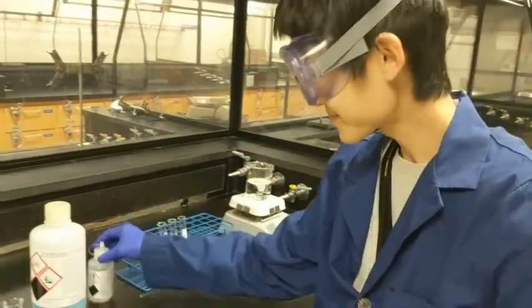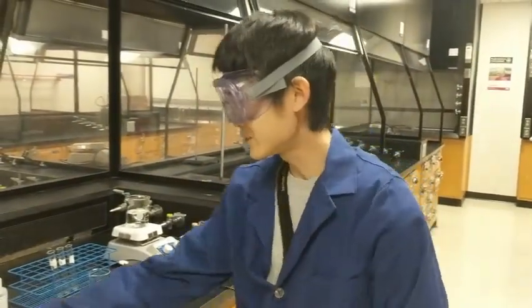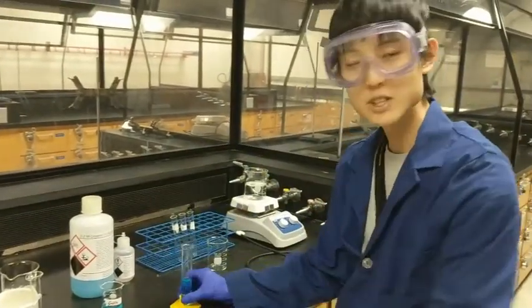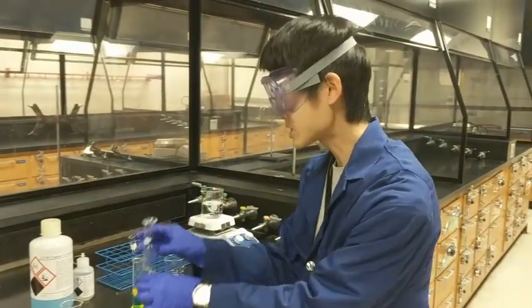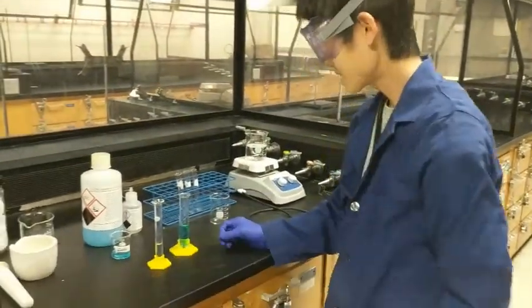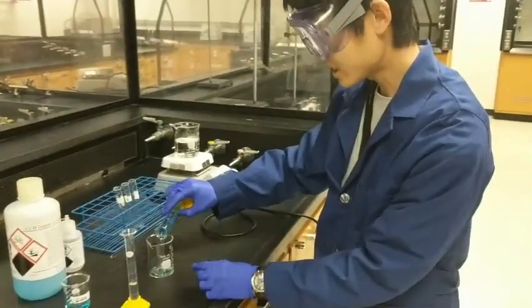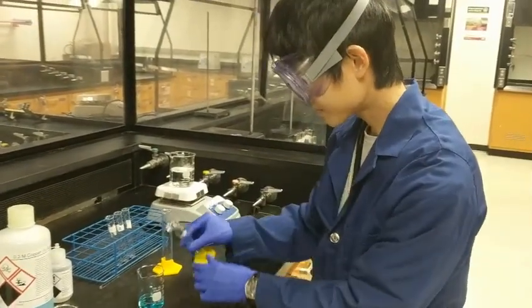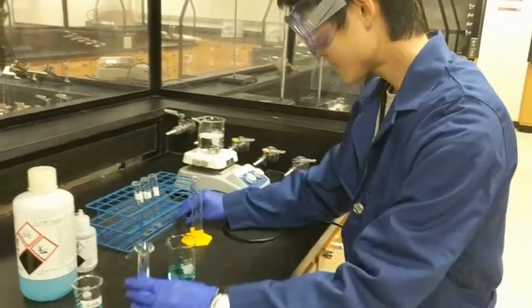Okay. So first, what we are going to do is measure out 15 milliliters of copper sulfate solution and 5 milliliters of potassium bromide solution. And we are just going to combine them together.